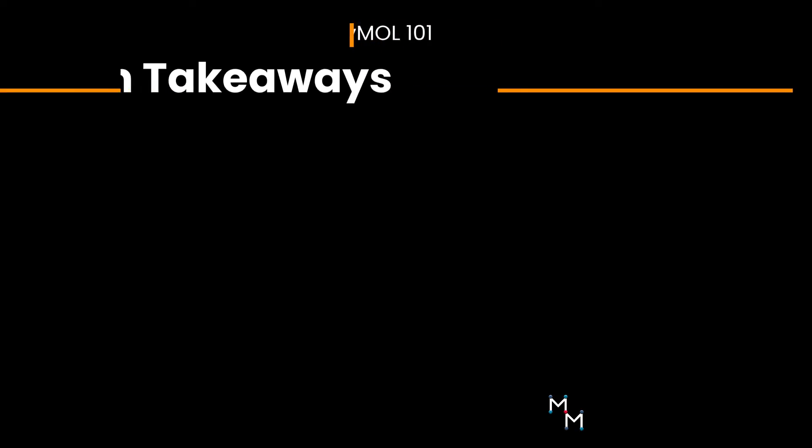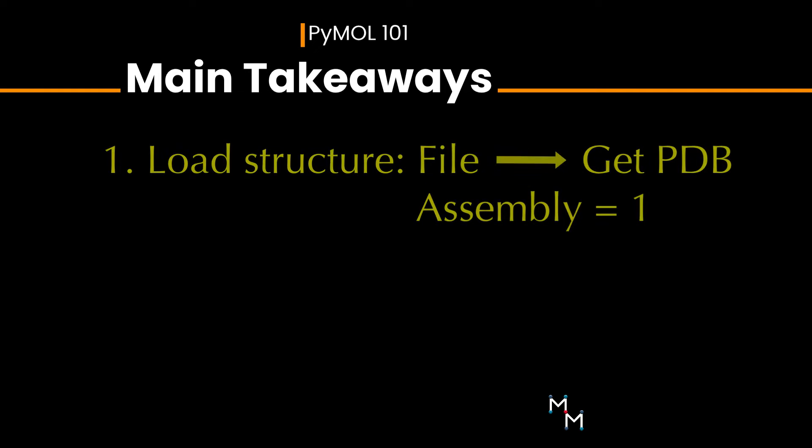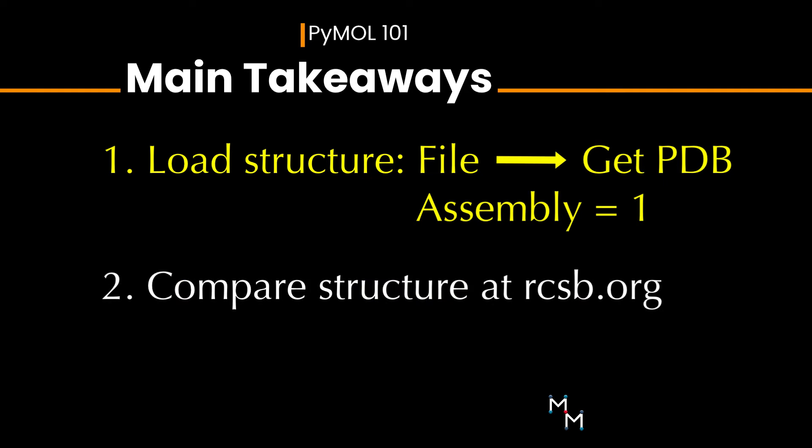Okay, main takeaways. Use Get PDB in the File menu to load structures and set the assembly to 1. Compare your structure to the image in the RCSB PDB to make sure it loads as expected. And visit the PyMole Wiki to learn command line codes.